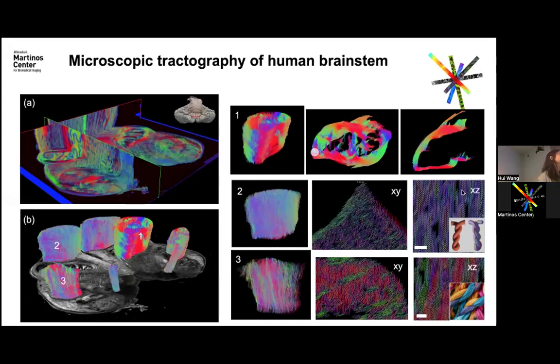I think it shows periodic features. If you look at the orientation closely, it's probably too small for individual vectors, but the color really shows a pattern of periodic color change. That made me think it may be this configuration. That's my speculation based on this data.